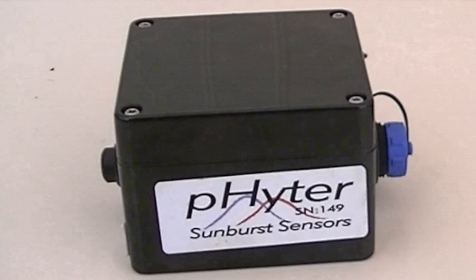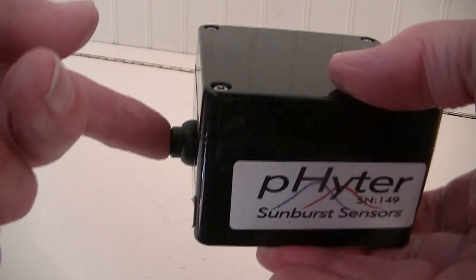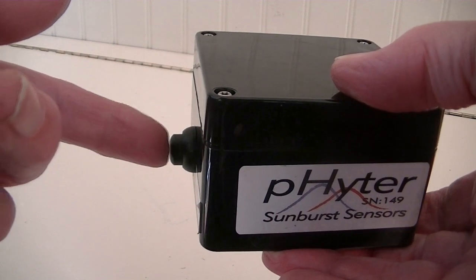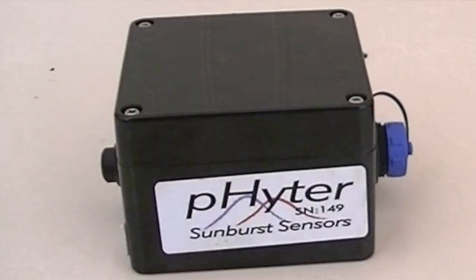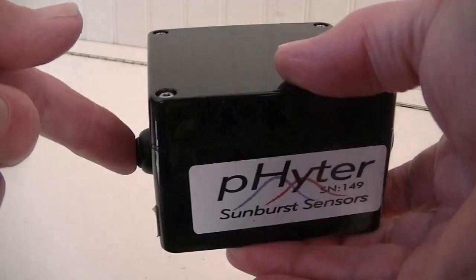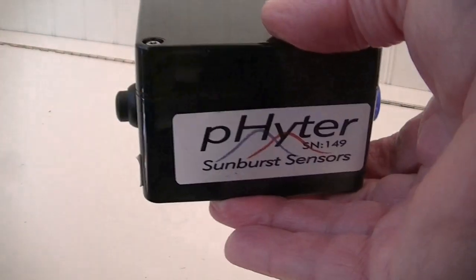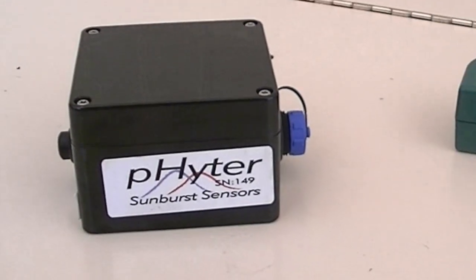The Phyta on-off button is a small push button here. It's a very small difference between the off position and the on position. The Phyta needs to be on when making measurements, or charging the battery, or communicating with the iPhone for sending data. When not in use, make sure it's off and that way the battery will stay charged for several weeks.